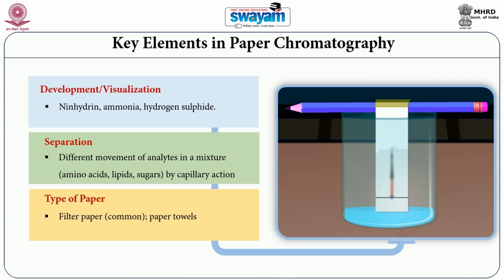So simultaneously, multiple visualization methods can be used in the same separation template or the same paper in which different compounds have been separated.